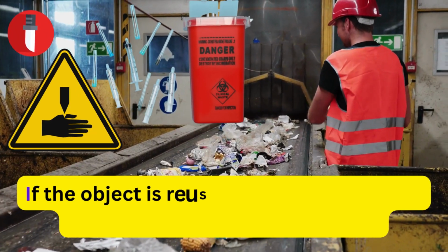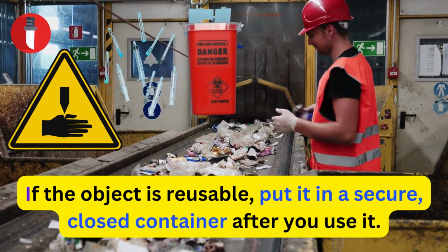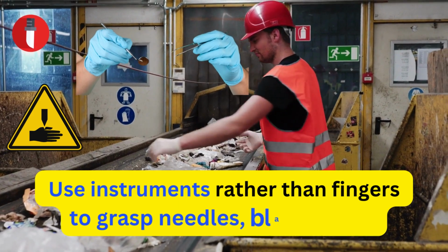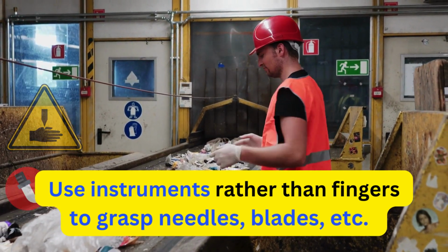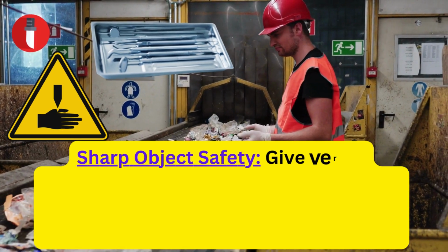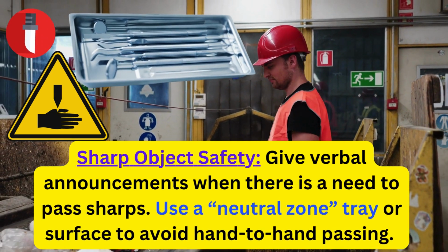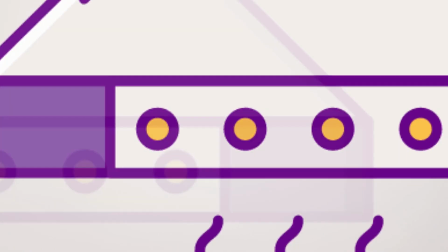If the object is reusable, put it in a secure, closed container after you use it. Use instruments rather than fingers to grasp needles, blades, etc. Give verbal announcements when there is a need to pass sharps. Use a neutral zone, tray or surface to avoid hand-to-hand passing.